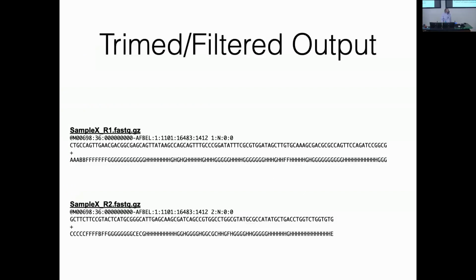Yeah, so if you're in a human genome, sometimes even 50 base pair reads aren't enough to uniquely position them in the genome, but for most reads, 40 or 50 base pairs is pretty good.